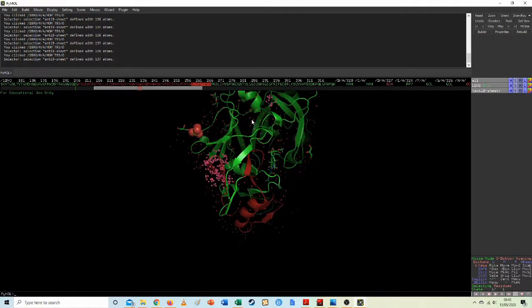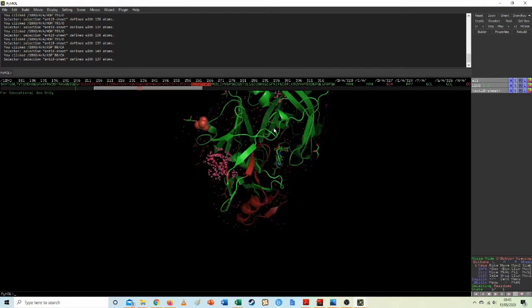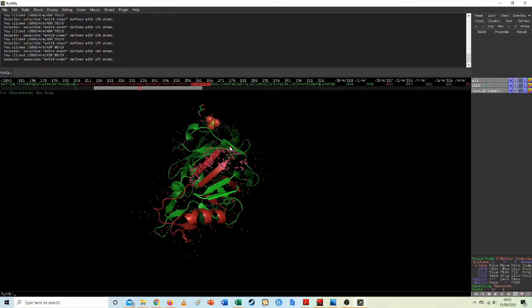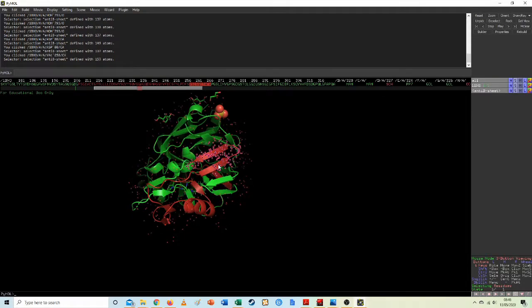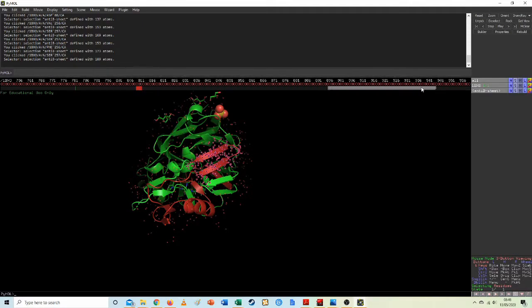Right, I'll come around here and we'll try and deselect you. And I'm just selecting more stuff, that's not very useful. And I'm not quite sure where these ones are. Oh wow. Right. So I'm not even sure where those residues are.